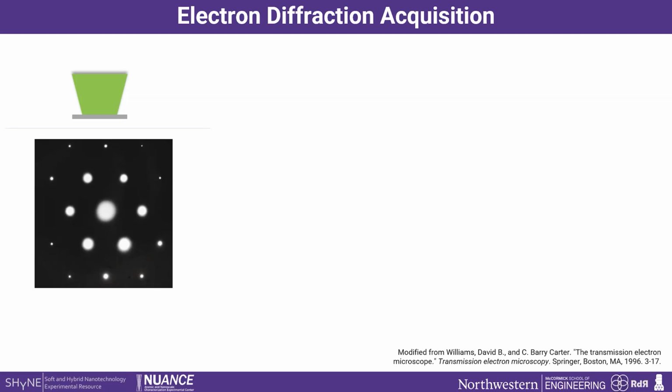So that is typically what you learn when you take introductory classes on TEM. And it's really simple to collect. You put an aperture in and then you have your diffraction pattern, which is easy to index. But it's a little bit limited in my view, and some other folks can talk more about that too.